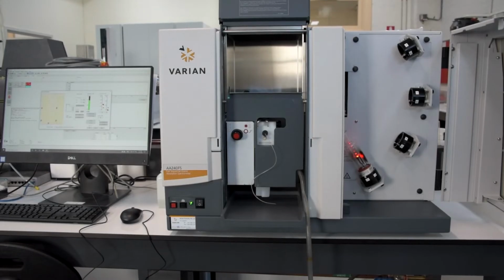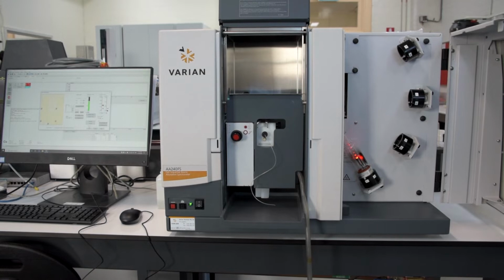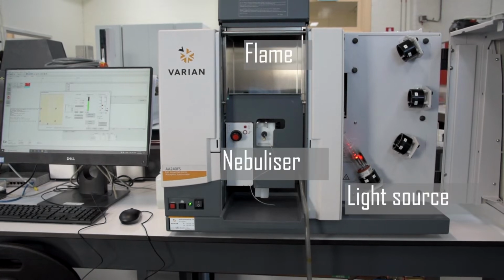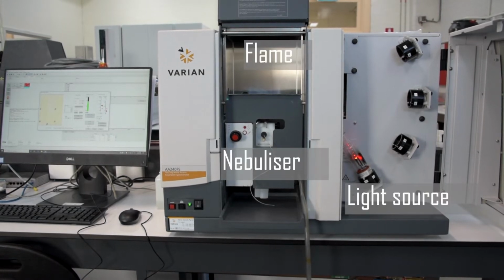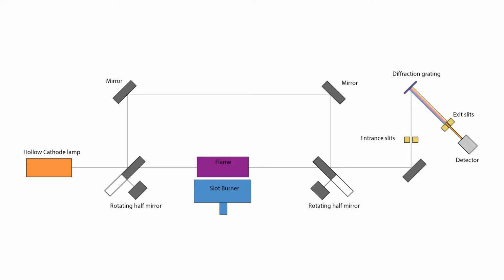Once the sample and standards were prepared, it was time to run them on the flame atomic absorption spectrophotometer. The light source, flame, and nebulizer system are easily identified on the instrumentation, but most of the instrument remains hidden inside the spectrophotometer box. A double beam flame atomic spectrophotometer will consist of a hollow cathode lamp as a light source, rotating mirrors to redirect the light around the flame, a nebulizer system, a flame, a monochromator, and a detector.